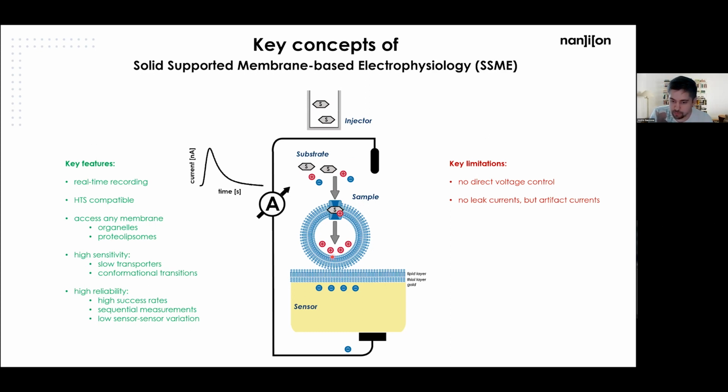And then the sample membrane will be charged. There will be a voltage generation. And that voltage generation acts as a counterforce for the substrate gradient, which is applied. And thereby the current you will record will decay within a few hundred milliseconds. And what we typically use as a readout is the peak, where no significant voltage was generated due to transport. So that will essentially reflect the steady state transport rate under the given conditions, which means the substrate gradient you applied.